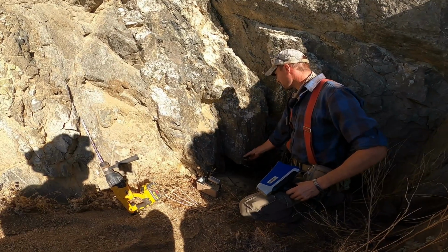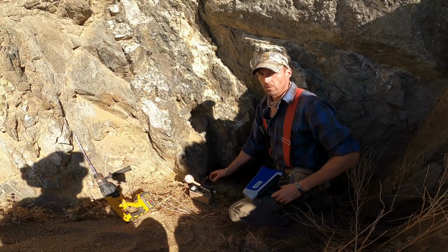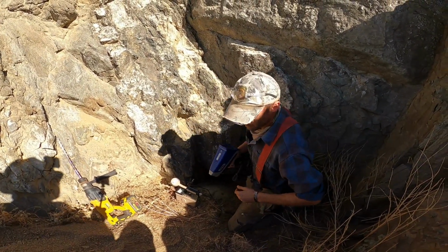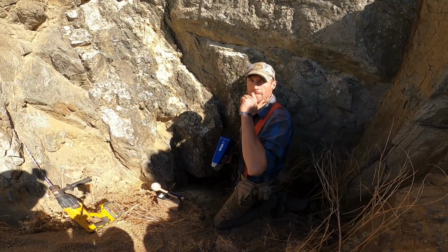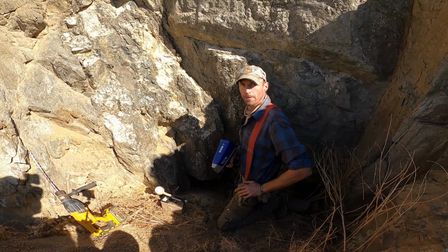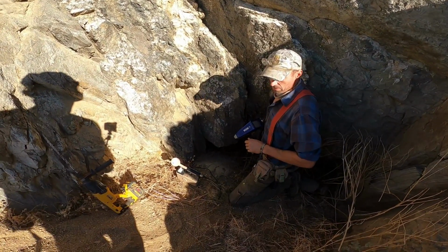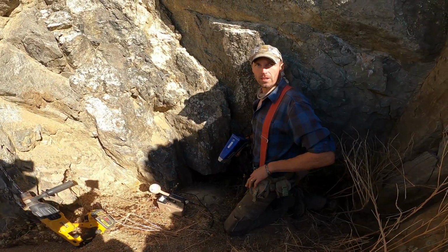So this spot we prospected before with the old XRF that we had, and we sent that in for assay. So we're going to repeat that same test with the Vanta and see how close we can get to our past results. And we were getting around 1% rare earths, right? It was half to about 1.5%. Yep. And that was chemical assay. We use these tools to help identify which samples to send in for chemical assay, for confirmation. I'll shoot the rock with this thing and it'll give us a rough idea of what we're dealing with, but a better way to determine the mineral content is just to grind it and send it in for assay to get a better idea.